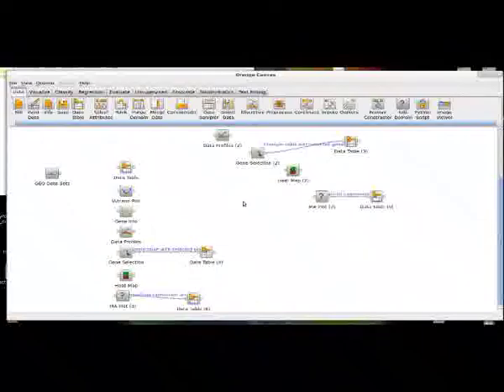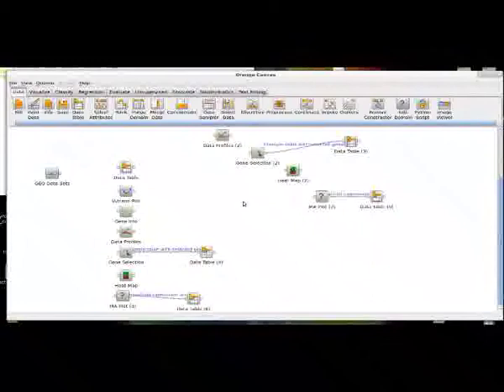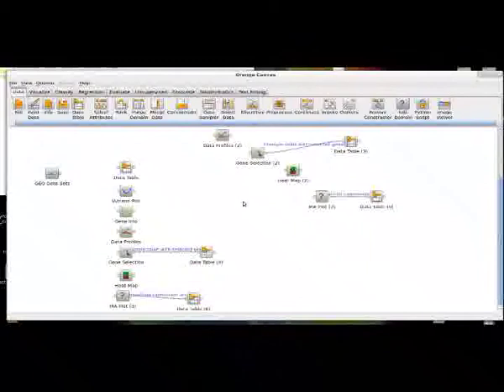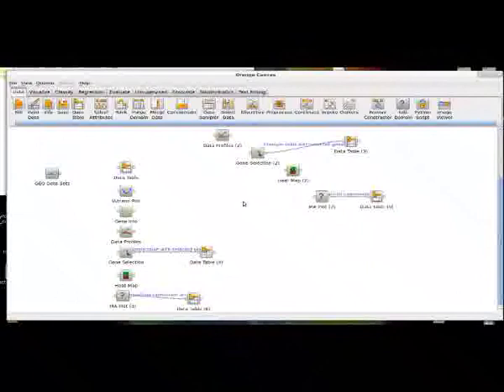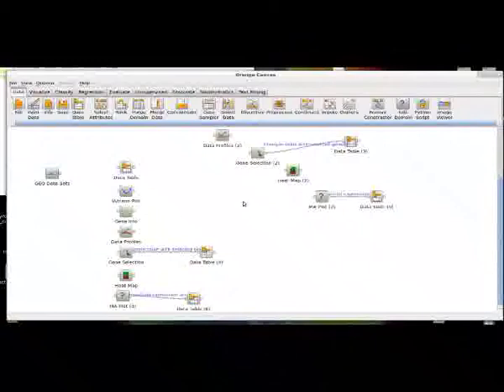So I've just gotten Orange back up and running, and after three attempts of transposing the data and then trying to cluster the genes in the heatmap widget in order to visualize them properly, all three times it crashed. So once again, the widgets in this bioinformatics add-on are not built into the core of Orange. They are add-ons, and they also have, as far as I have found, little to no documentation on the internet. And so some of the widgets might be temperamental.